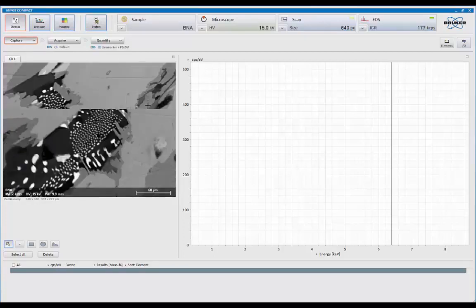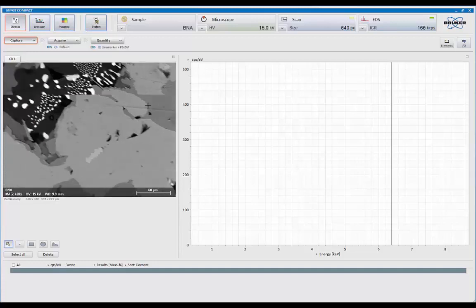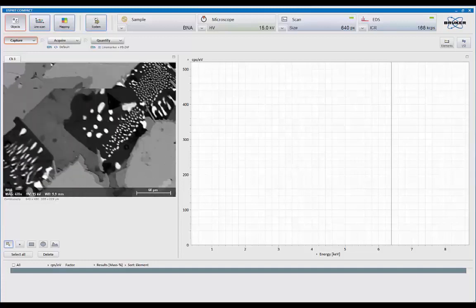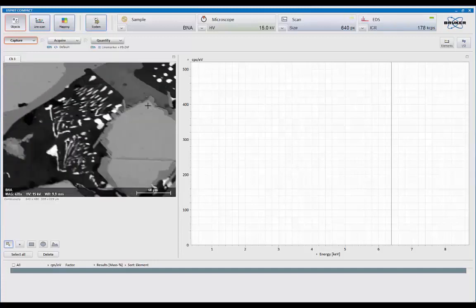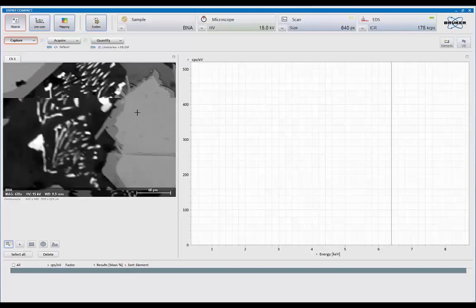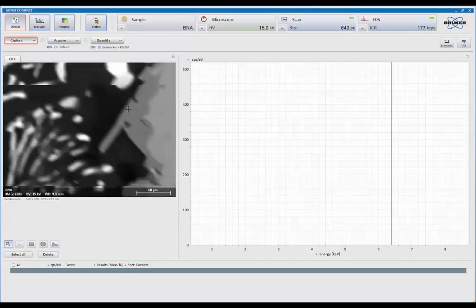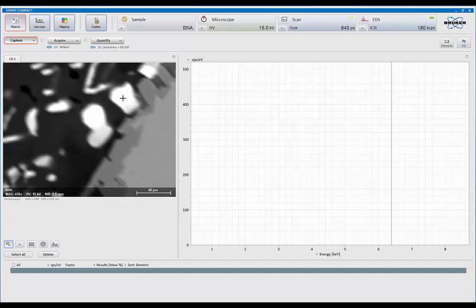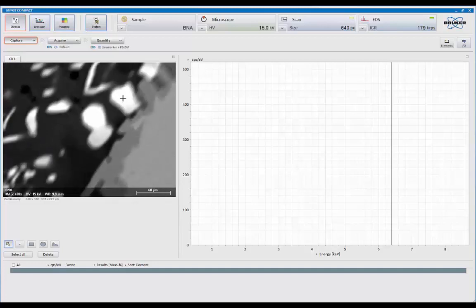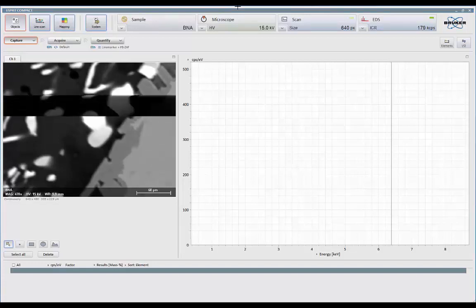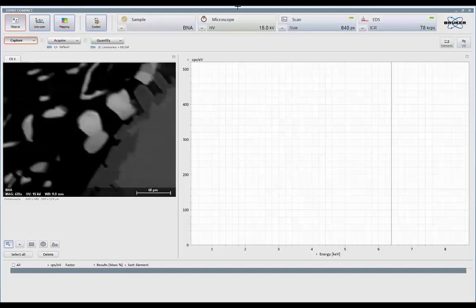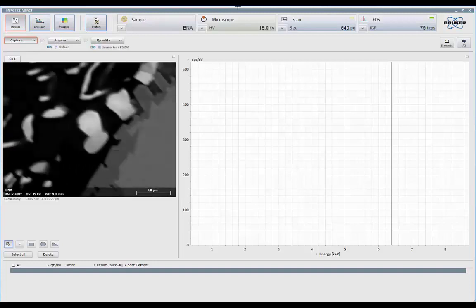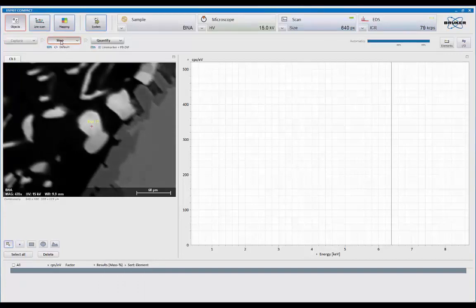So what we're going to do is let me zoom up on a different area of the sample. So I'm just going to move over a bit. What I want to do is look at one of these very, very bright regions. So I'm going to come up. Let's see if we can focus that up a little bit. Let me adjust my brightness, contrast a little bit.